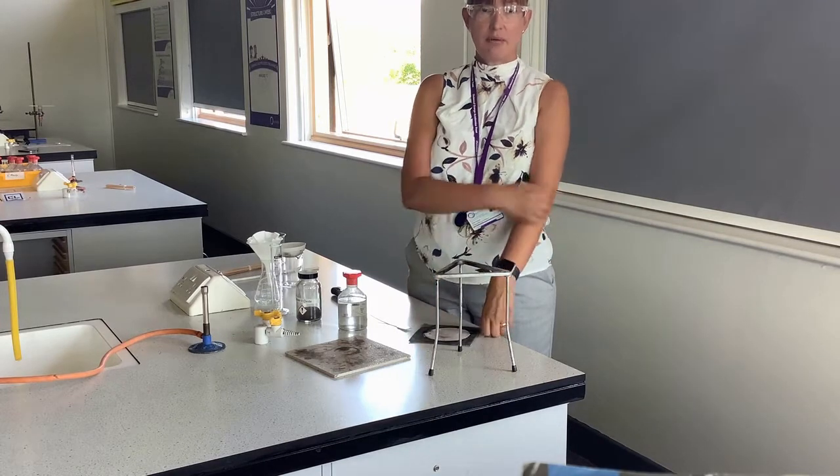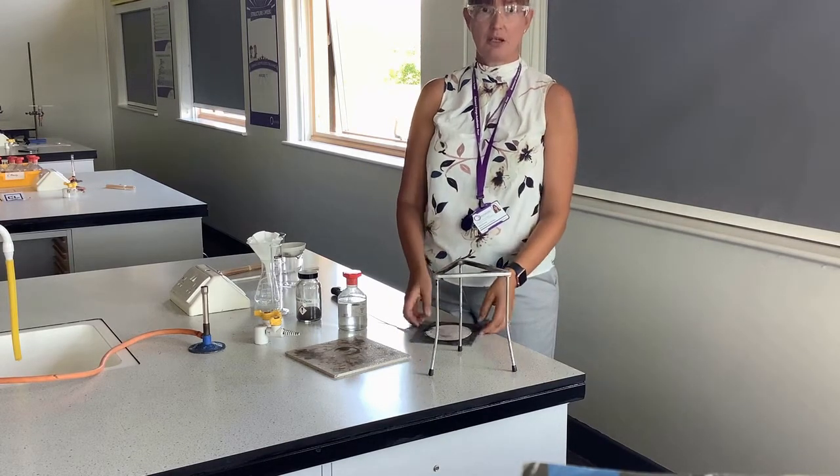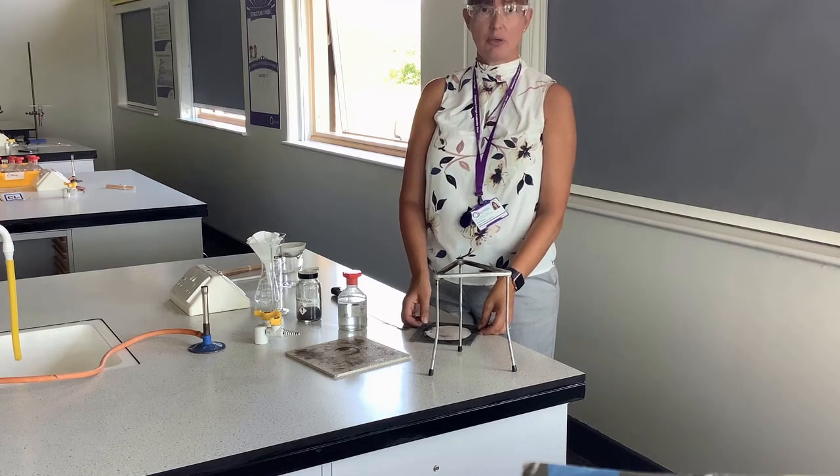Hello, my name is Mrs Kershaw and today we're going to look at the required practical for making soluble salts.